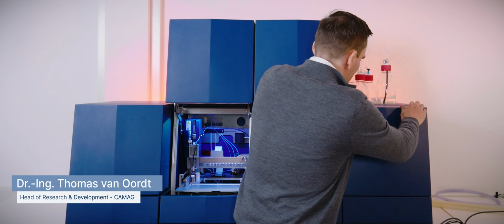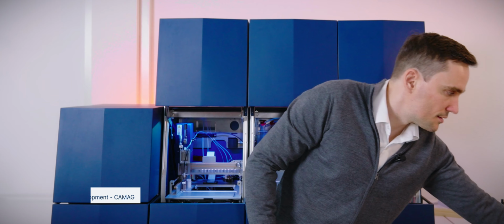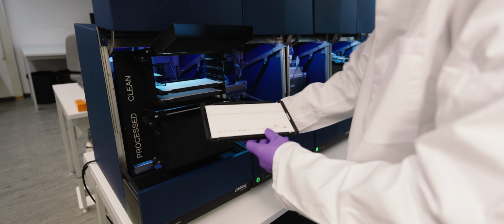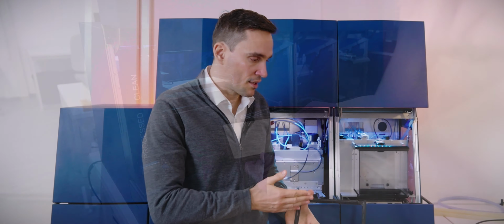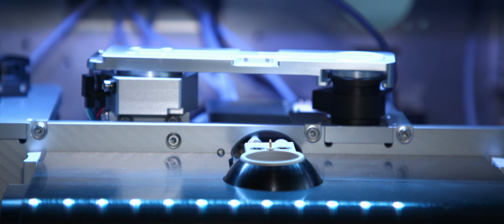Derivatization involves a surface reaction. That means we have our samples on a plate. The plate has already been developed, i.e. the substances have been separated, and in this module we spray the plate with a reagent.